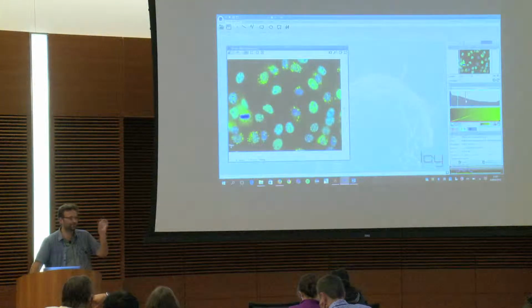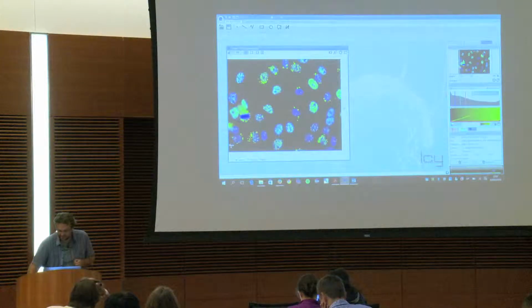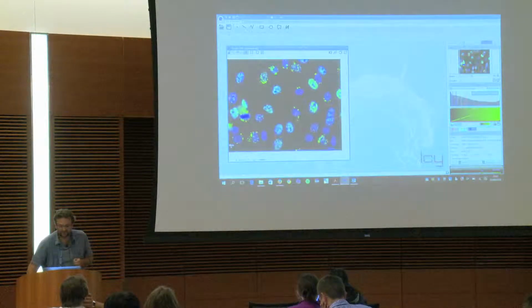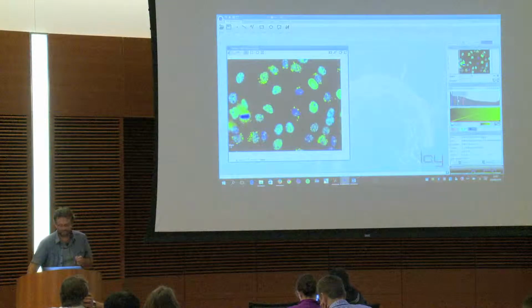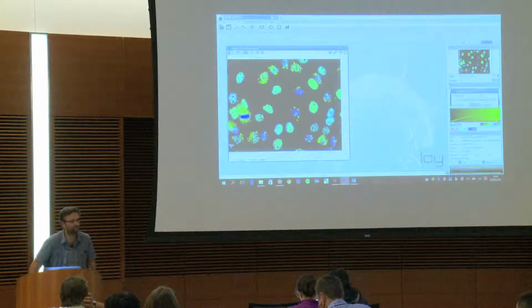So it's going to be performed in between those 2 extrema that you provide with this blue bar and this red bar. And if you press the green one, you shift everything. If you double click on it, you can set them manually.